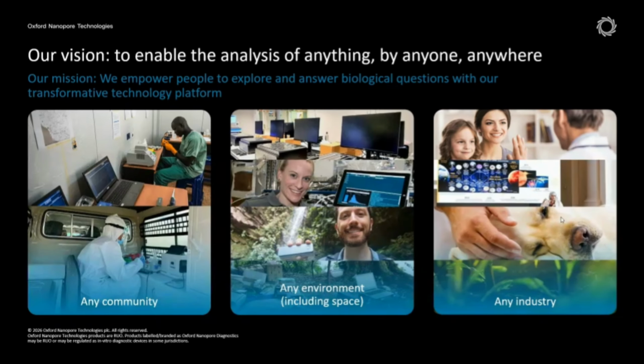The users of ONT have used the platforms to understand biology in many different fields or domains. That includes pathogen research, epidemiology, and studying the environment, like samples from different regions, including space. Players from different industries have also used the platforms for different purposes.